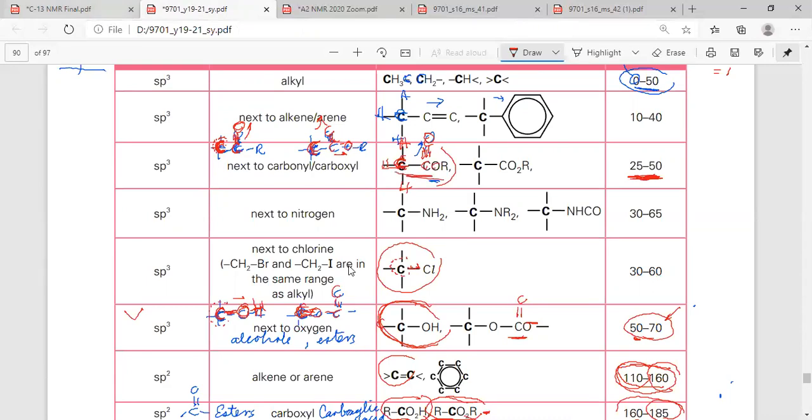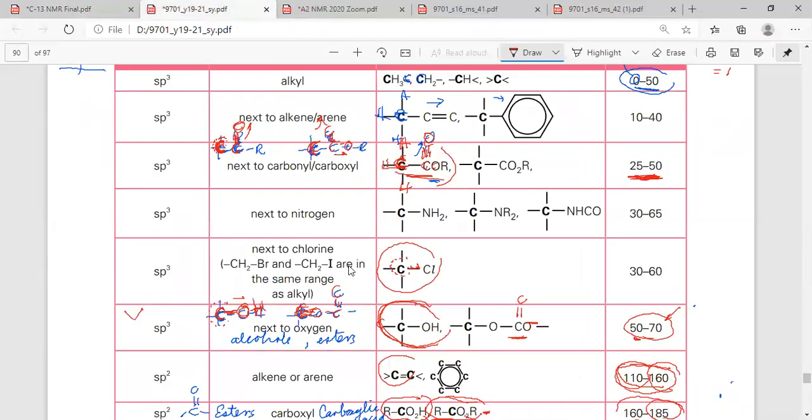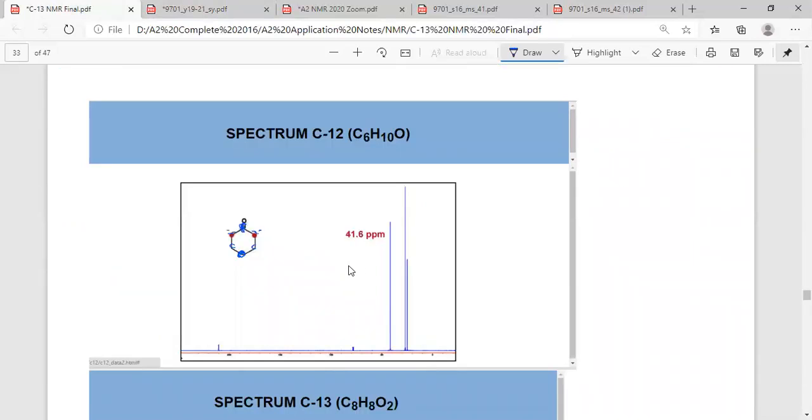25 to how much? Let's see. 25 to 50. So, okay. Right. 25 to 50. Because here is hydrogen, there's carbon, isn't it? There's carbon here. So this is the one here. This is this one here. Okay. This one here. Right. Now this one here, the small peak here. Okay. Let me see, I think it's this one. Not very clear, this one here.